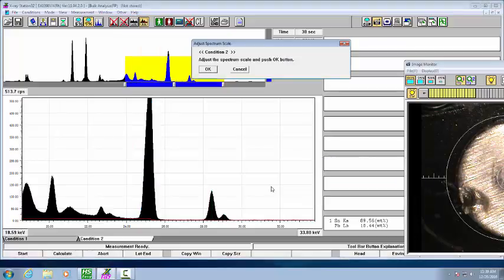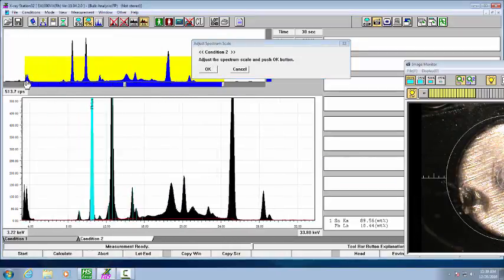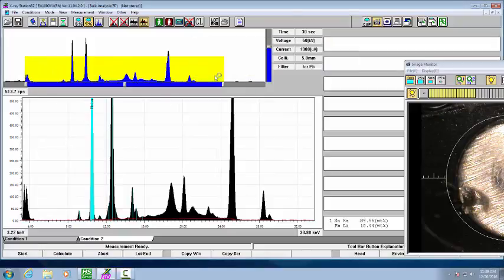Hit OK. Now we can do it for our second condition. Go like this and see the lead peak down there. Hit OK.